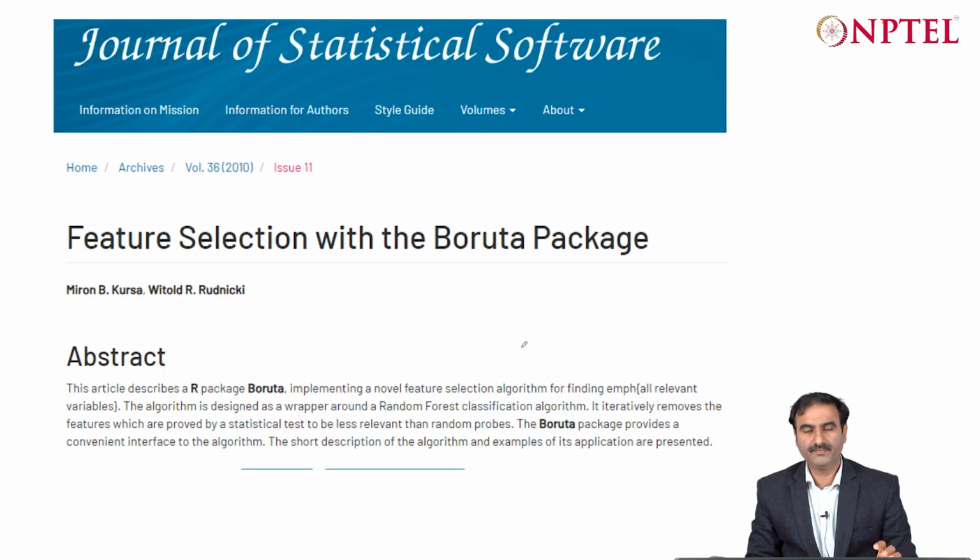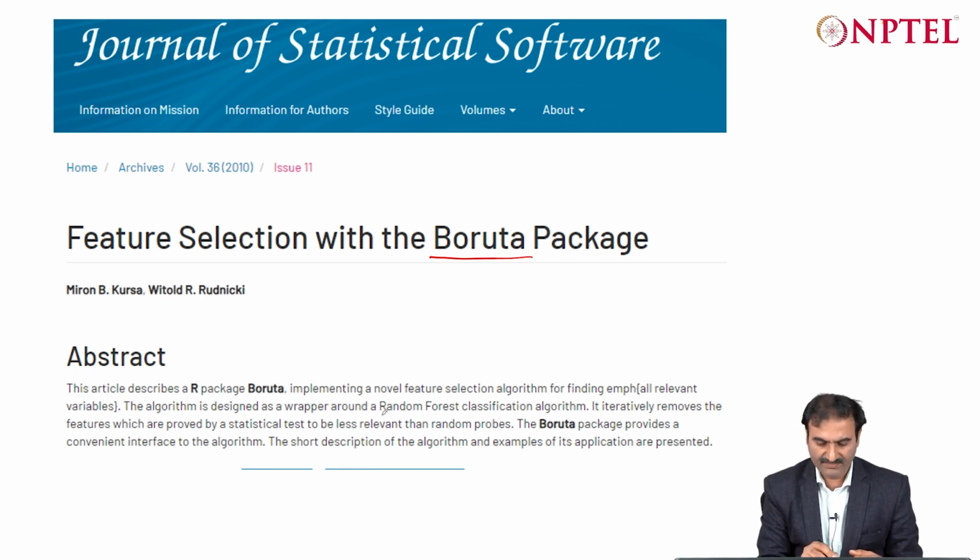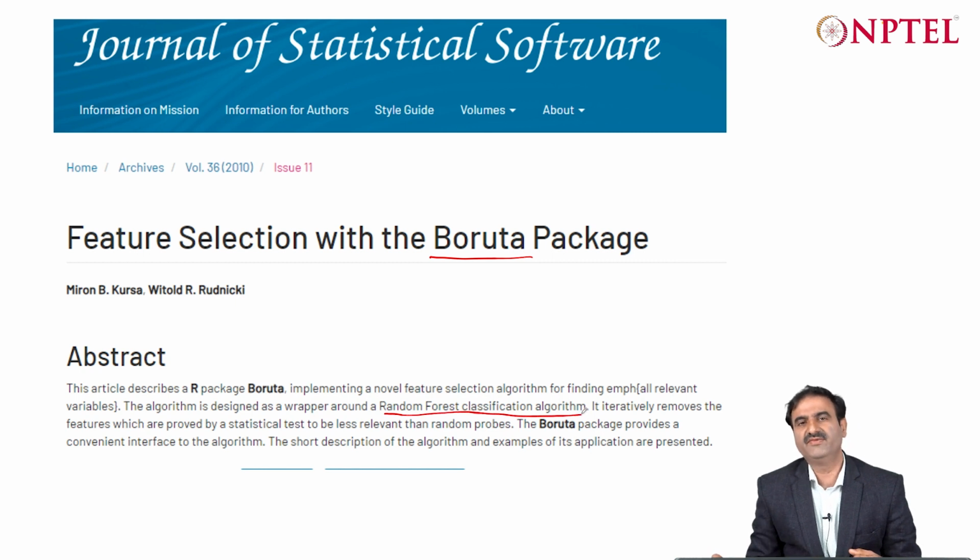Similarly, one more tool or package that you will be using either in metagenomics, or when you are doing machine learning or AI-based work, when you are doing feature selection, or you want to do some prediction from the metagenomic data, right? So one of the software that you will be using is Boruta. Okay, so Boruta is based on the random forest classifier, right? Which is an ensemble-based classifier, and it's a kind of wrapper around this random forest classification algorithm, which deals with classification of the data.